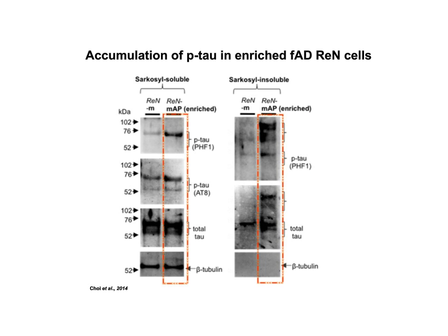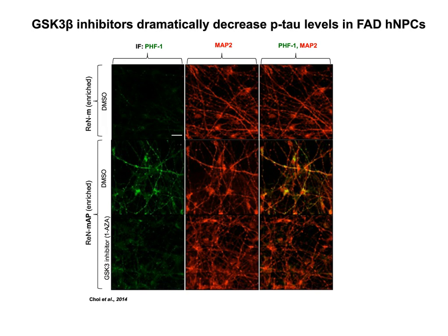And one more thing we tested is whether any kinase is involved in the increase of phospho-tau. Among those tau kinases, GSK3 beta is a well-characterized kinase. Still, there are many possible tau kinases that mediate A-beta-induced tau phosphorylation, but we actually treated our system with these GSK3 beta inhibitors, and you can appreciate the robust decrease of the phospho-tau in our system, with just 1 week of treatment.